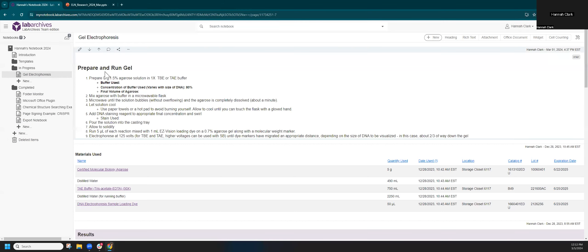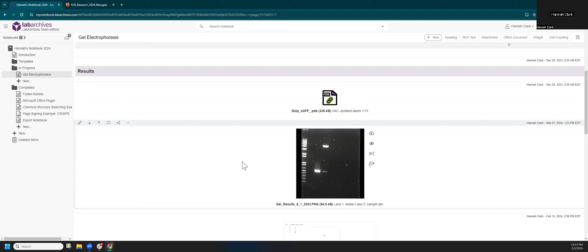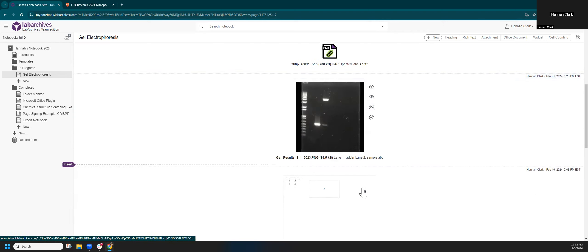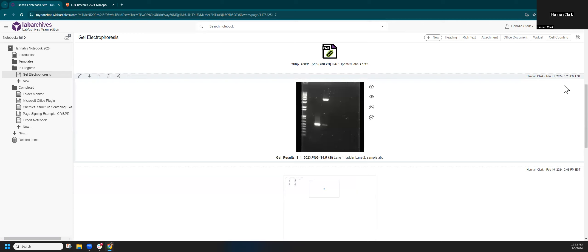On a particular page — such as this gel — I can see the information relevant to that page. Pages have various entries. At the top is what we call a rich text entry for notes, observations, and text. I have some materials listed, and down here I have file attachments. You can have attachments of any file type. There's an excellent question in chat: how long are notebooks kept archived online? Your Lab Archives notebook has a full audit trail — everything has a date and time stamp so you can prove authorship.